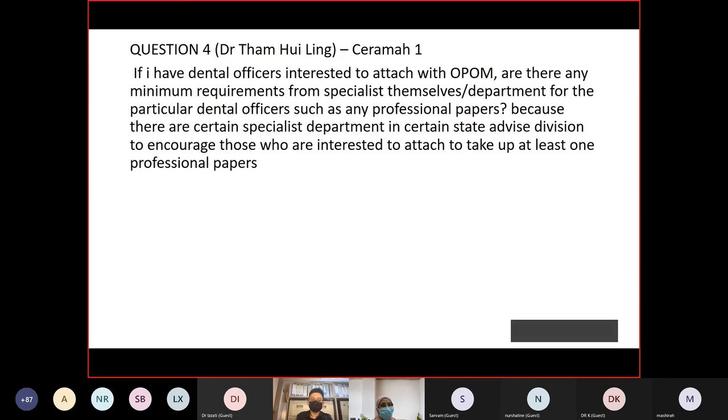When they receive that, it will be disinfected and stored in one place, and they will only process it either once a week or once in 2 weeks. I asked the lab here why that is so. One is to save PPE, but also to make sure that the specimen is really fully fixed.